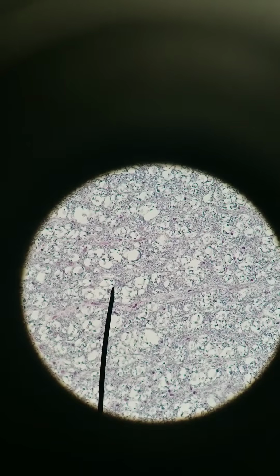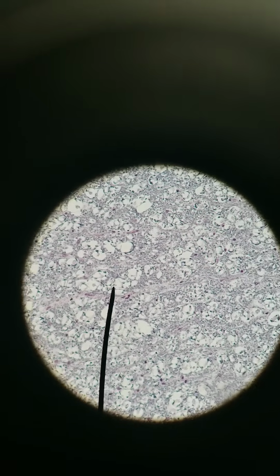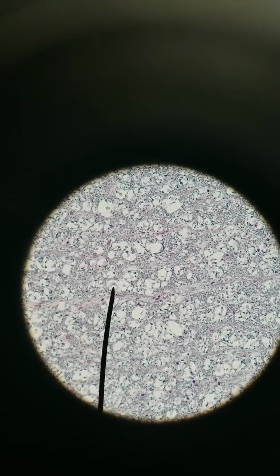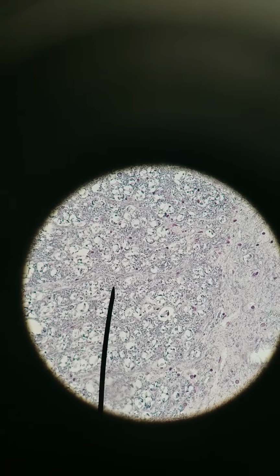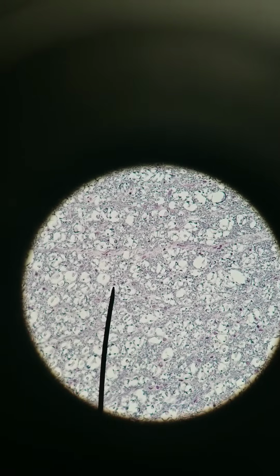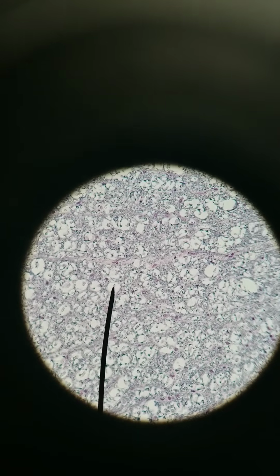Going to 400X, you can see the very center of these circular things. That is the axon. The white part is where the myelin would be, and then it's surrounded by endoneurium, the connective tissue of axons. Actually, it won't be connected, but covered by that. That's only in the periphery. But anyways, these are axons covered by myelin. Axon covered by myelin, and that's in the white space. Going back out to 40X.